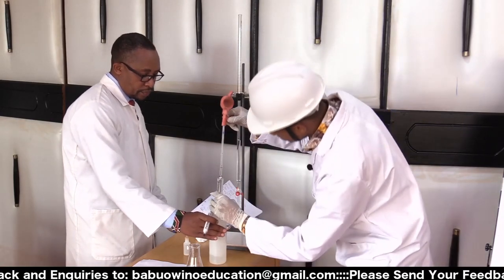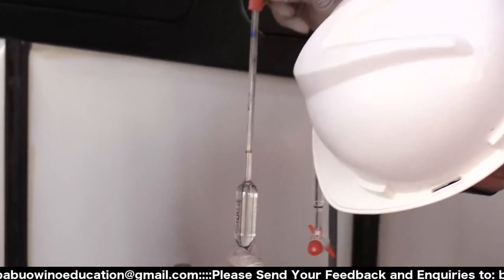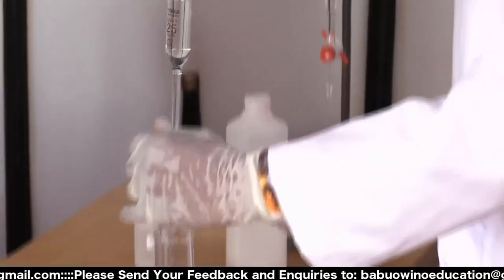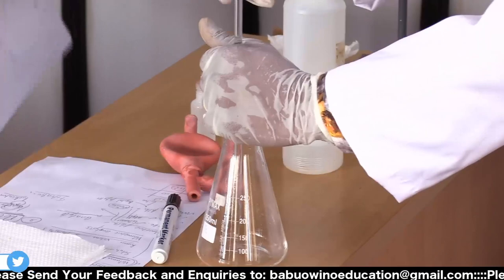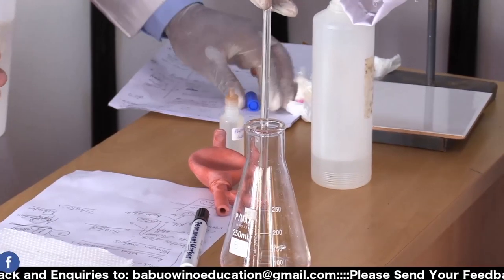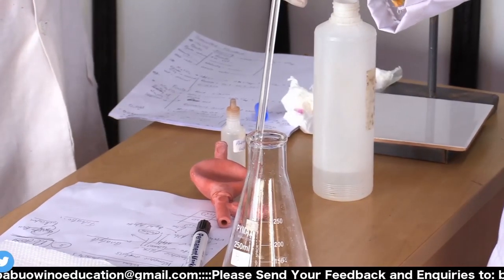So be very careful, class, in rinsing your apparatus, because it might affect your next practical. Some of these things, we decided to do the second practical to let you know how you need to move on to be accurate, because if you just do it, you will find very big differences in values. We are doing this intentionally, so that when you find different values with different variations, you see how to work it out.